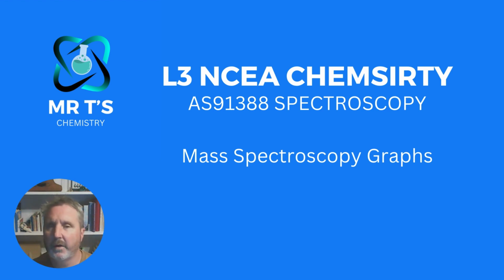In this video, we're going to be looking at Achievement Standard 91388 spectroscopy. In particular, we're going to be looking at mass spectrographs and how we interpret them.